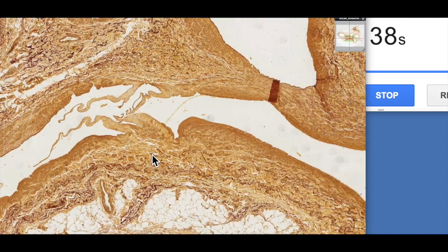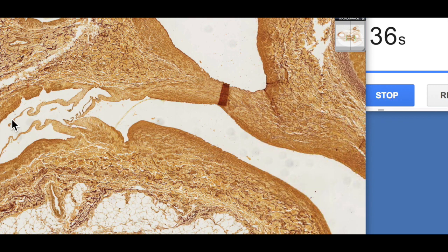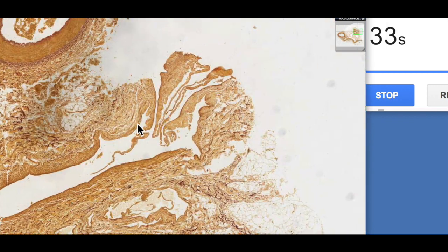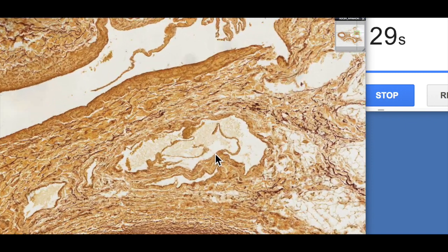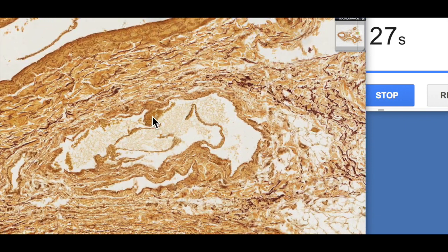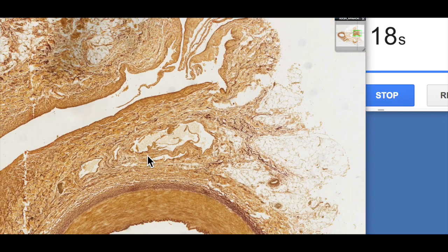So this is a vein. So you can see the valve leaflets here. And in this one up here, I think we can see another couple of valve leaflets over here. And even here, look, we can actually see these little extensions of these leaflets. So another vein here. It's really amazing when you sort of start seeing them, you begin to pick them out amongst other parts of the tissue as well.